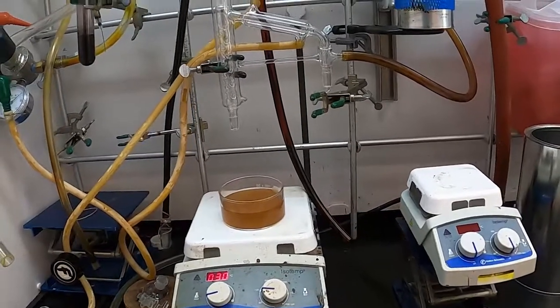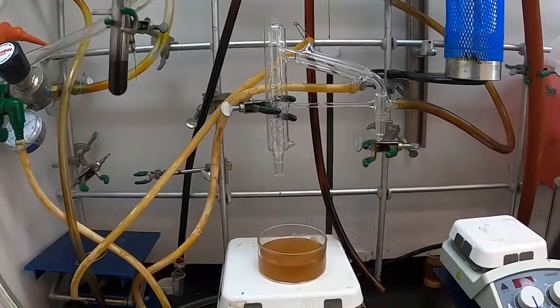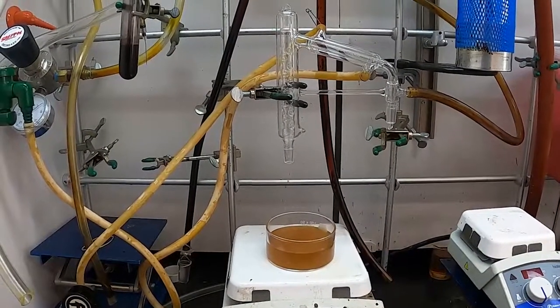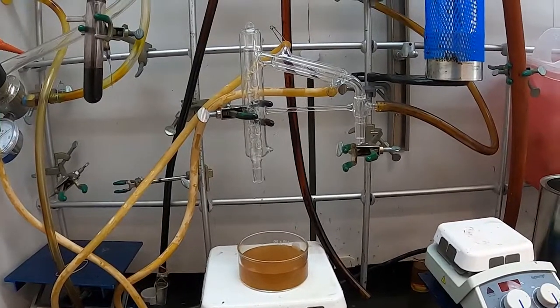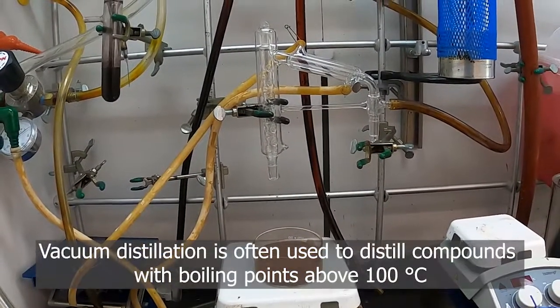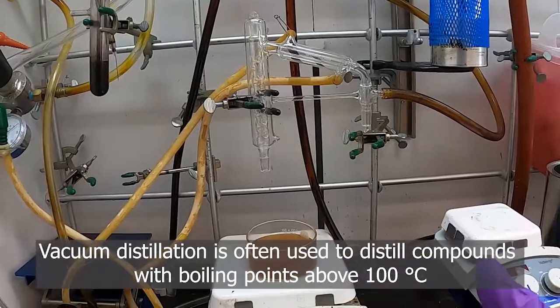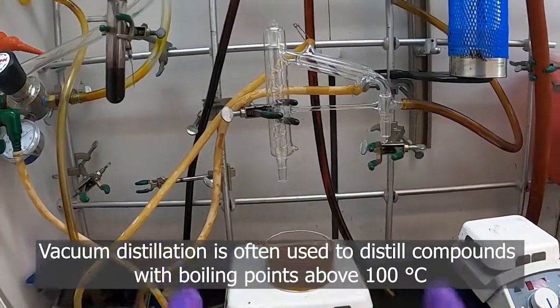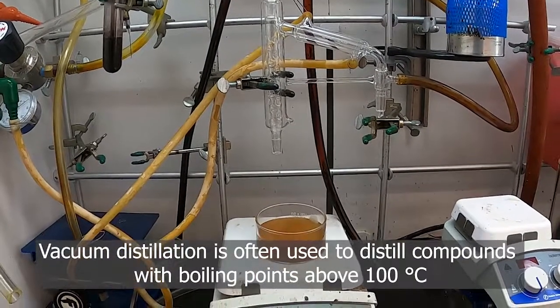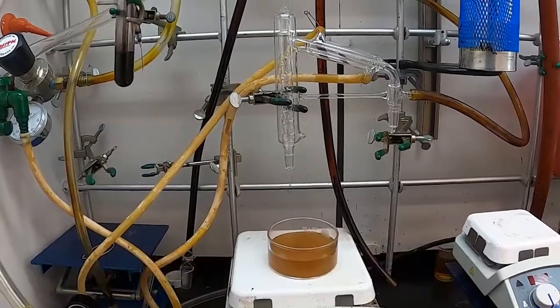A little bit about vacuum distillation. If we have a higher boiling compound that we want to purify by distillation, vacuum distillation is the way to go. You can reduce the temperature at which the compound boils by putting it under lower pressure, so you don't have to heat it as hot to affect the distillation.